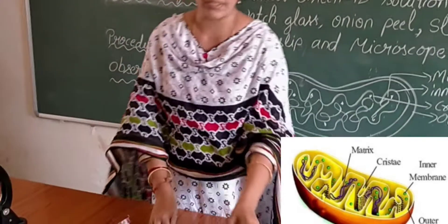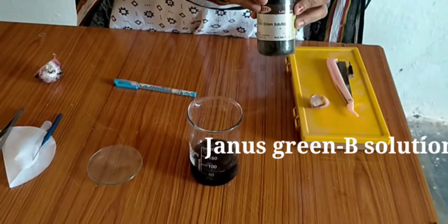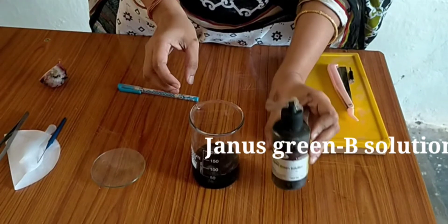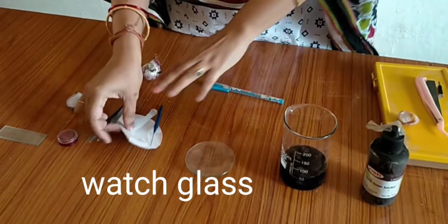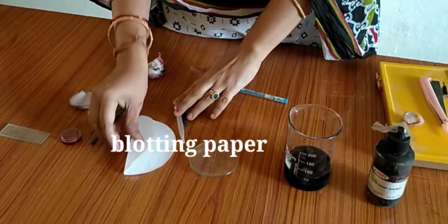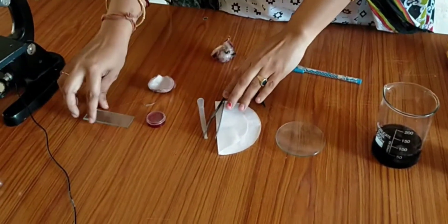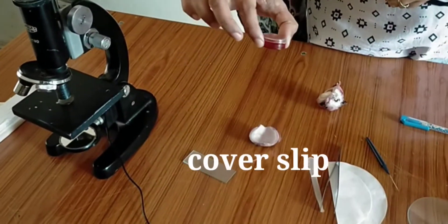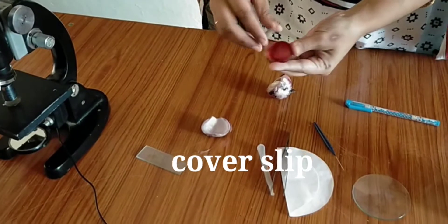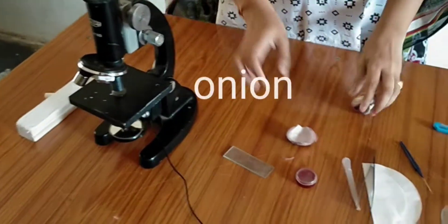I will show you the materials required for the activity. This is the Janus Green B solution reagent. This is a watch glass, blotting paper, pillar, forceps, slide, cover slip, microscope, and an onion.